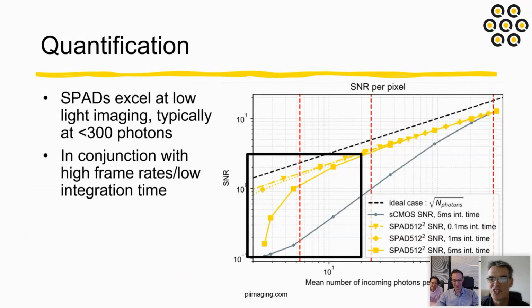With super resolution imaging, what can you do with SPADs? So why would I want to use a SPAD for super res? In this webinar, we focused on confocal microscopy. There SPADs excel because they have pixelation. So they offer you to improve the resolution by a factor of 2 purely because they have pixelation. Details on that can be found if one searches for image scanning microscopy. This is really great theoretical work done by many researchers. SPAD enabled this super resolution.